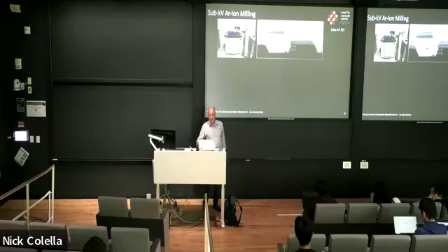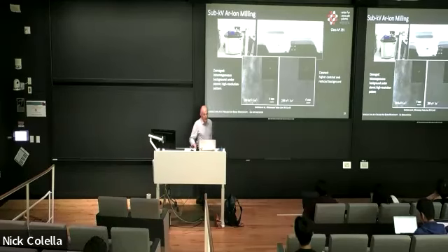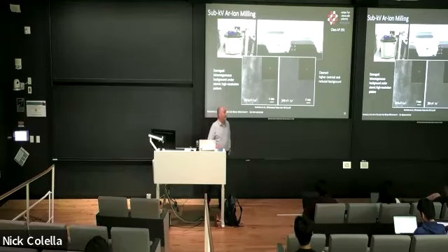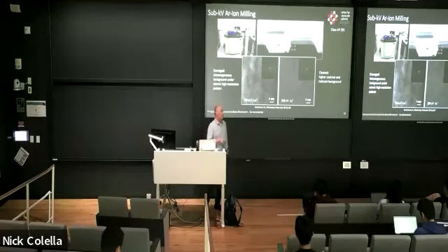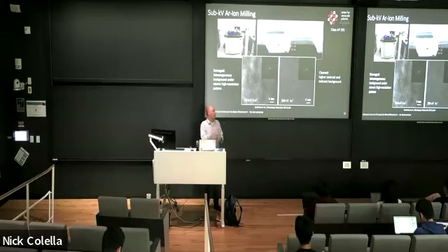And so ultimately, what we are then using in the end is a low energy ion milling tool where we can polish the sample very carefully with argon ions that have only an energy below 1 kilovolt, so typically 500, 700 volts. And there we are now entering a true polishing regime.